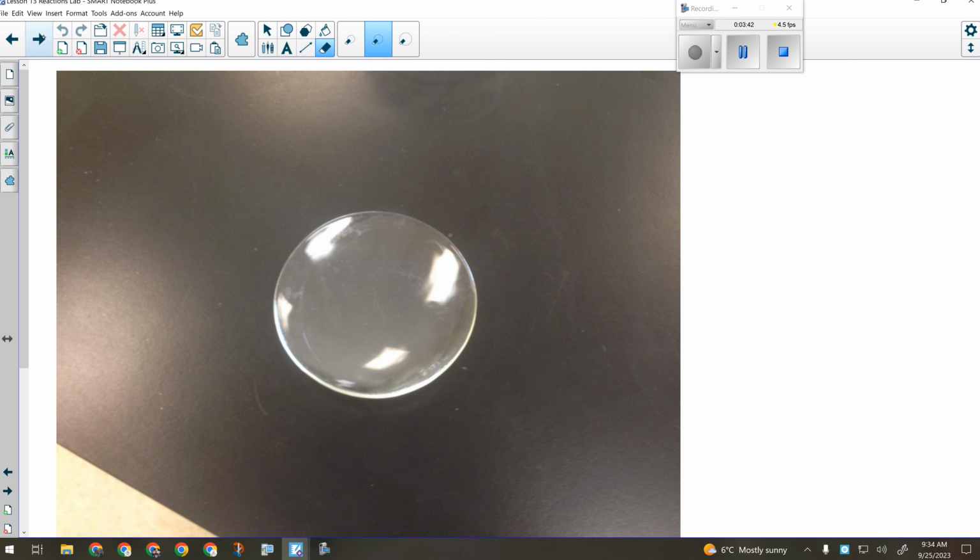this. It's like a giant contact lens. It's about this big around. And you're going to do the reactions in that watch glass. You'll have a big space, and more of this stuff, because obviously some of our sources of error were that we had small amounts of everything. It was difficult to do in the little depression plate. So we're going to do all the reactions in this watch glass and rinse it in between.